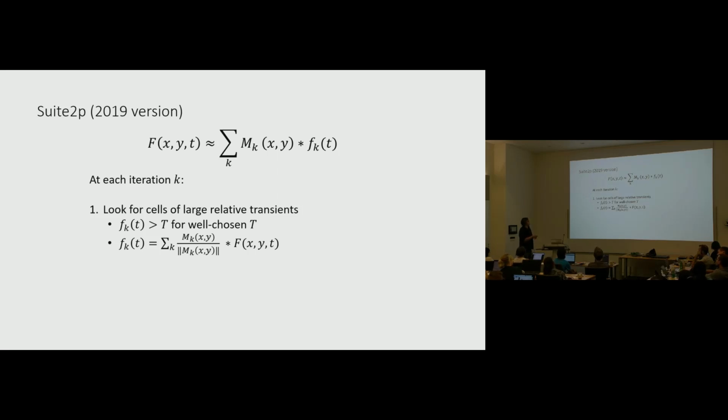And it turns out that if you do the math and plug it in, and ask, if I do know the mask already, right? Let's say I assume as my initialization some kind of blobby mask of just some pixels inside a circle or something. Then what should my F be for that cell? It's basically just the weighted average of those pixels. And so that's how I estimate the F.